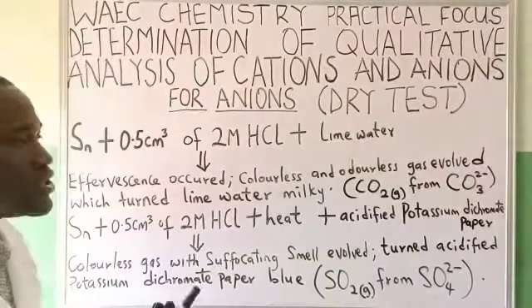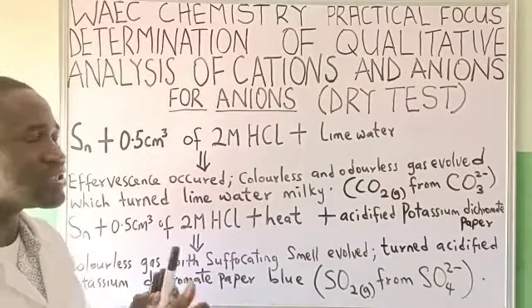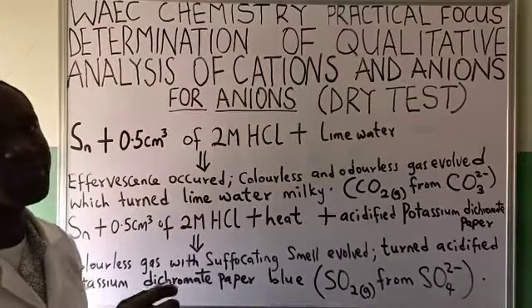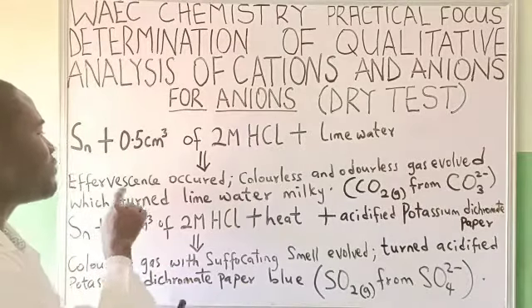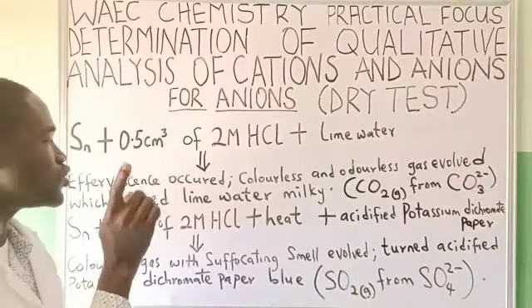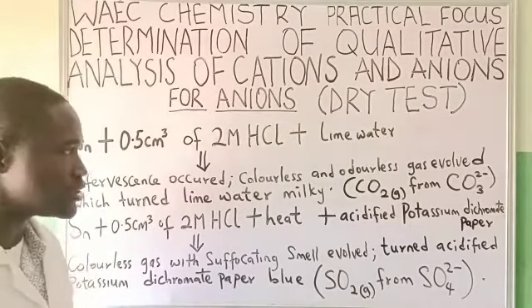We put it in reported speech, or past tense, because you just performed it and you are now reporting it. That is what I mean. Don't put it in present tense. Not "effervescence occur, colorless and odorless gas evolve, which turns lime water milky." No, put it in reported speech.